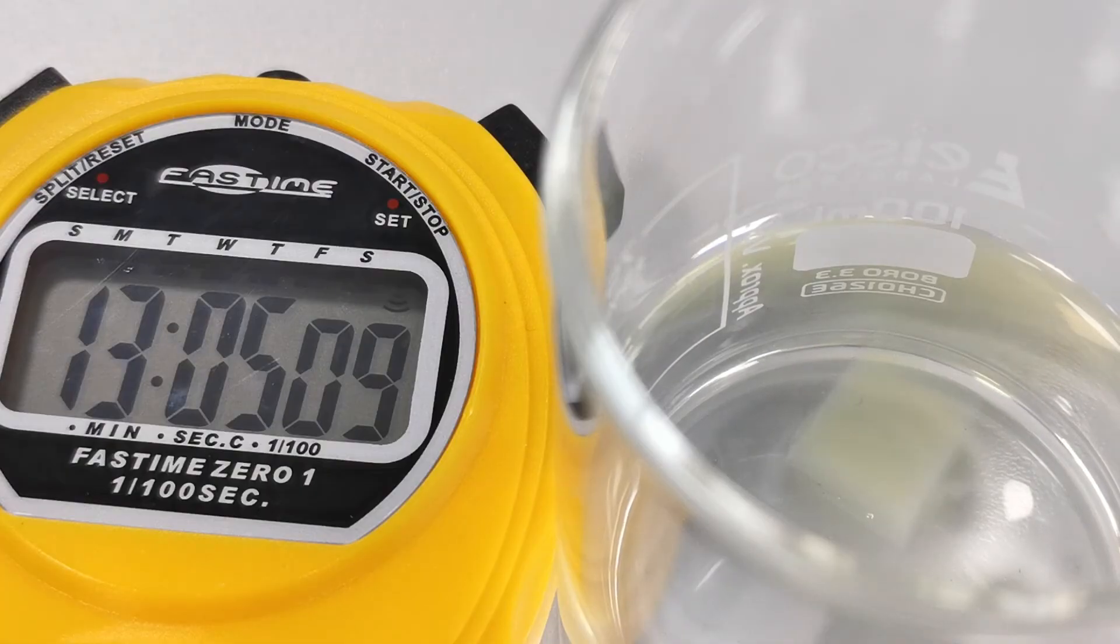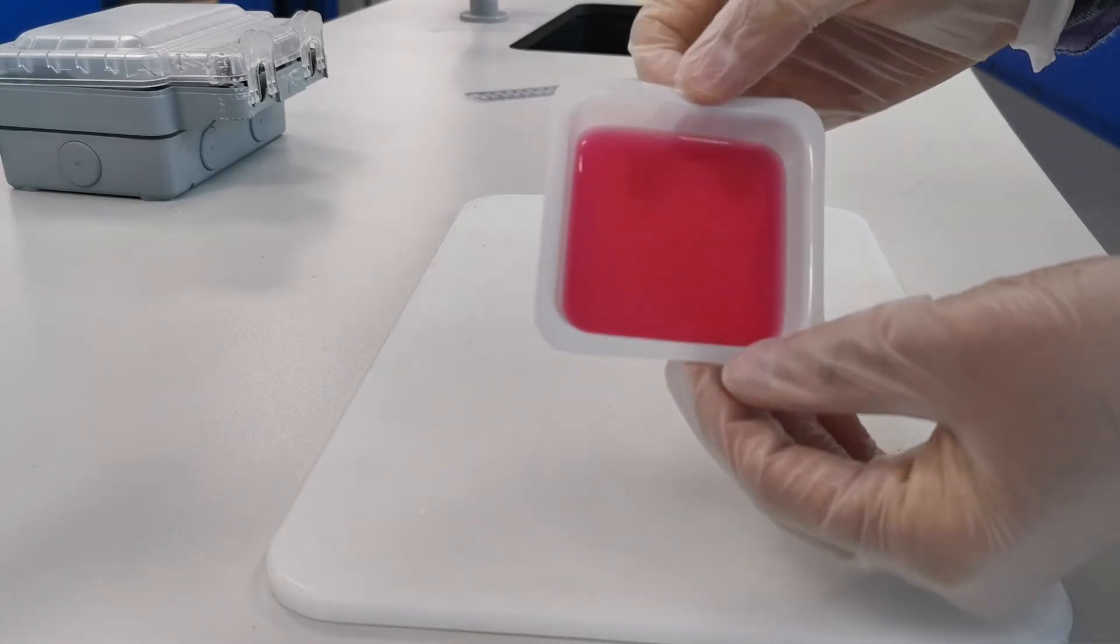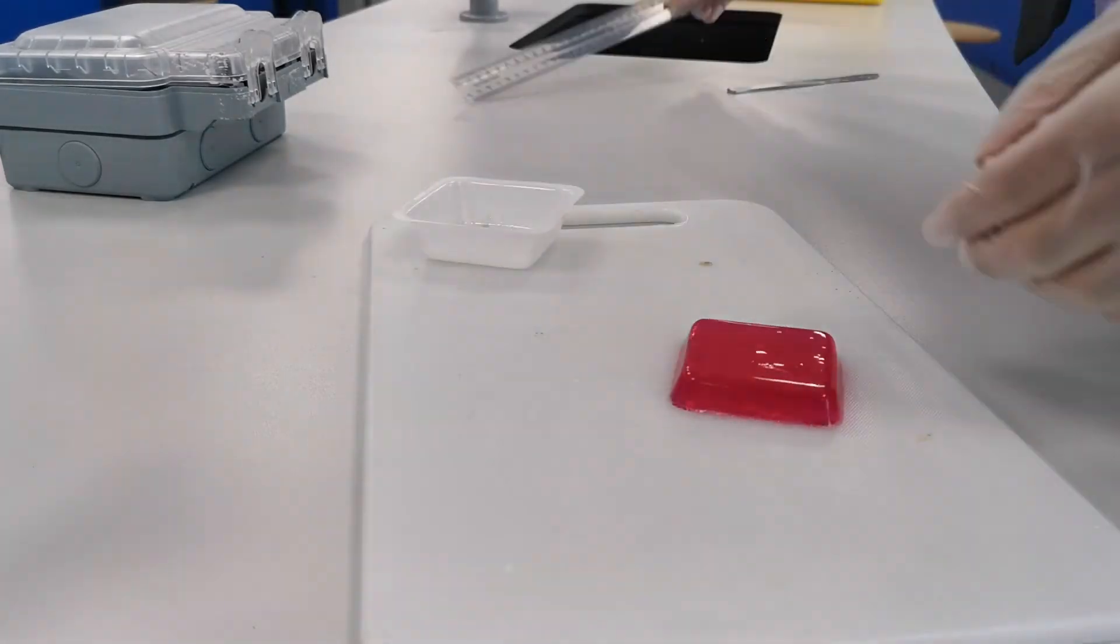And there you have it. By comparing the time taken for each cube to change colour, we can observe first hand the relationship between surface area to volume ratio and the rate of diffusion.